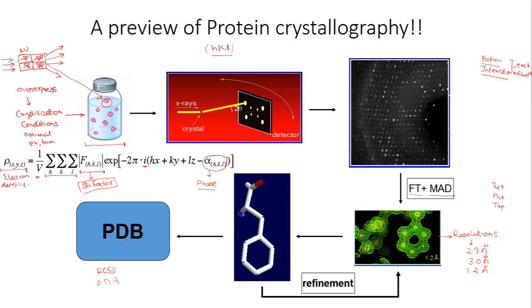It is the model of a protein that you usually download from PDB. It is a resource responsible for storing and disseminating structural information. So now the scientific community can download the model that is deposited in PDB.